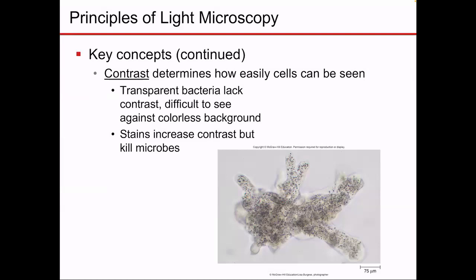Well, we apply stains, or dyes, and these may color the cells or the background depending on the kind of stains you're using. We're going to talk more about staining techniques next week, so just wait only a week to discuss that topic.